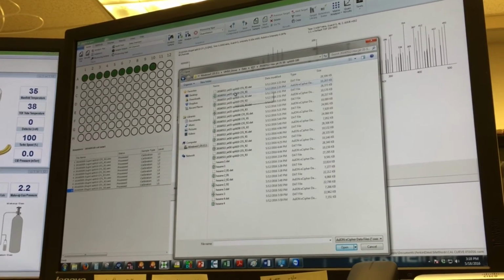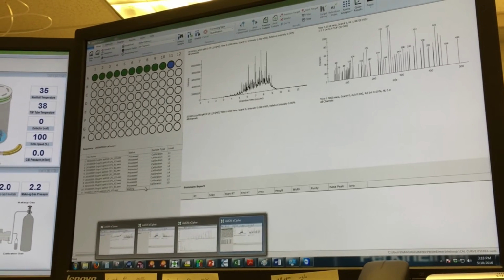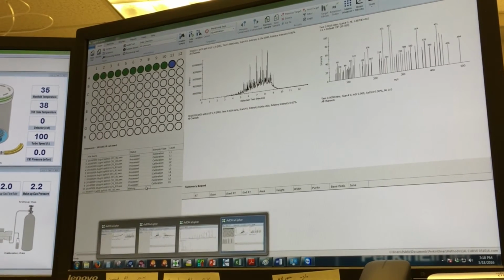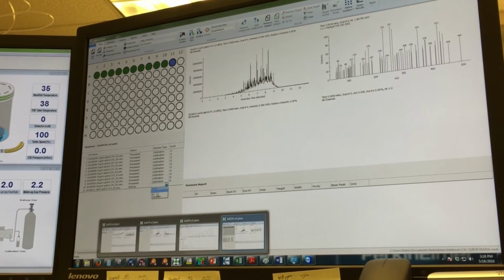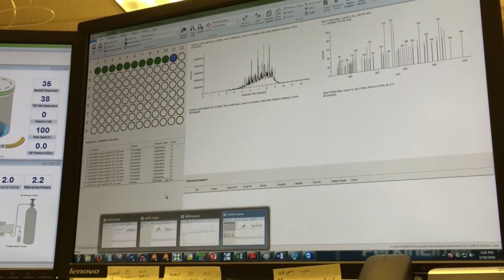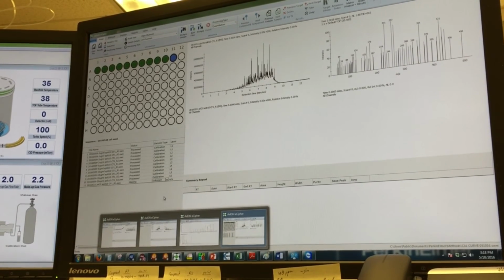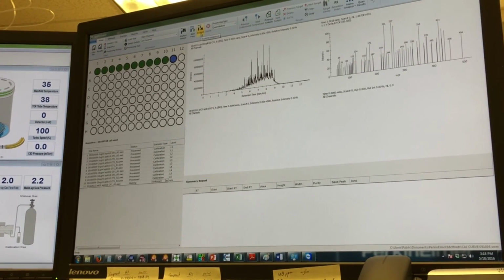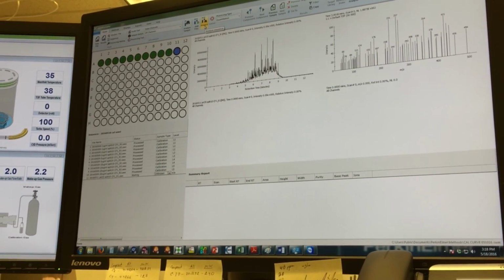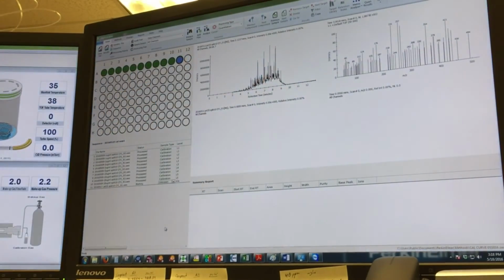So suppose you choose this file, then you have to add the status. You have to choose the sample type as unknown. So when you make the calibration curve for the sample, you will choose unknown and label as not applicable. Then for the whole file, you will go again to analyze, then you will click on analyze, then you will get the result for the generator. Okay, so this is for quantitation.